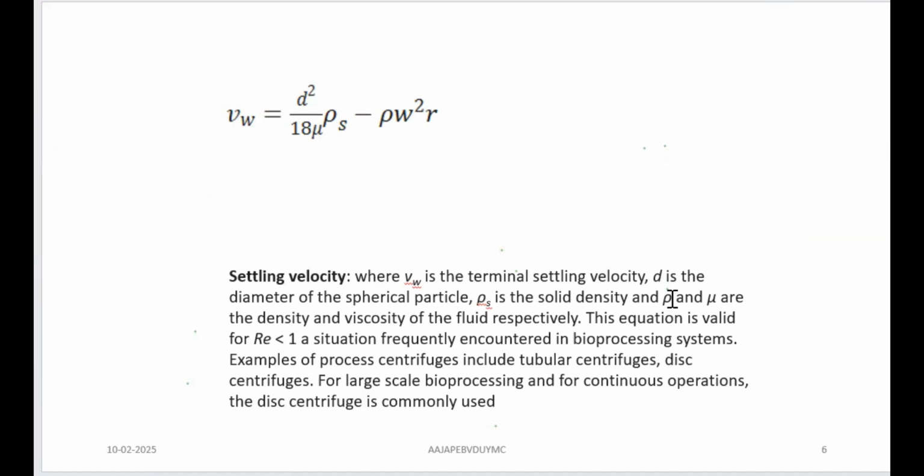So the factors which contribute to sedimentation are not only centrifugal field and the R value, that is the distance of the sedimenting particle from the shaft, but the terminal settling velocity, then D, the diameter of the particle, then the density of the particle, that is rho s, density of the suspending media, that is denoted by letter rho, and viscosity of the suspending liquid, that is the fluid in which your particle is.